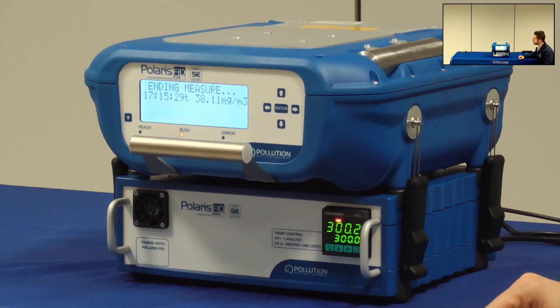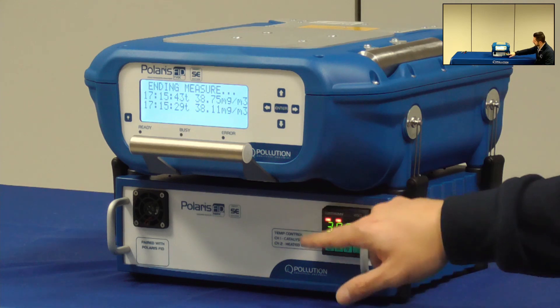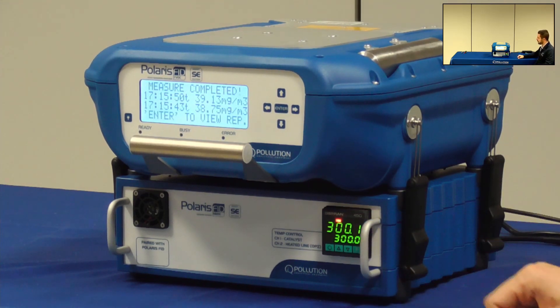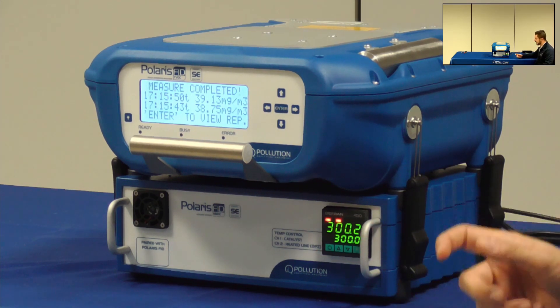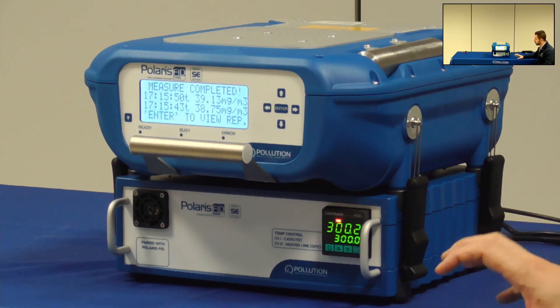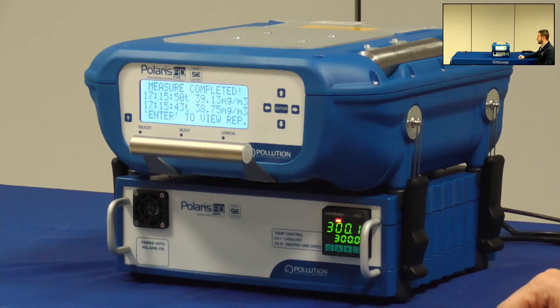Meanwhile you can see here on the docking station a display with two different temperatures. The bottom one is the temperature set by the manufacturer and on top the actual temperature of the oxidizing catalyst. This value is found during factory calibration and it is the temperature at which the catalyst has its best performance.